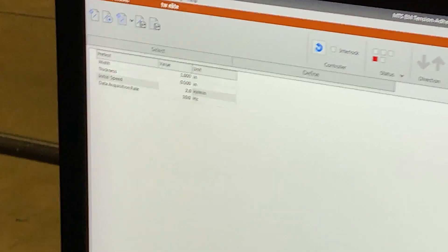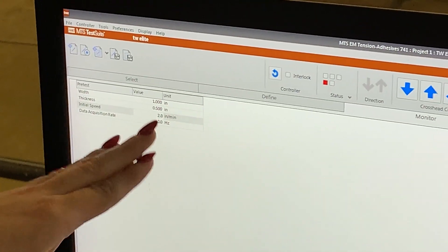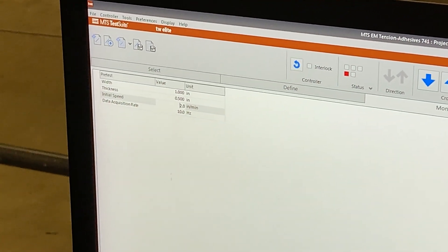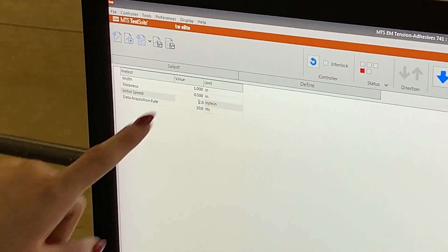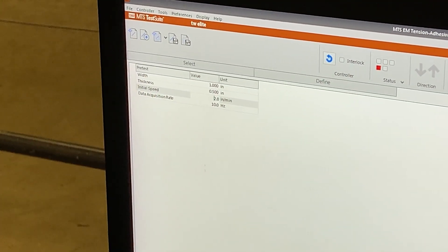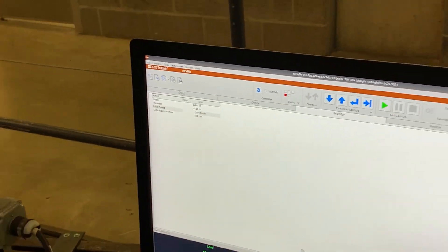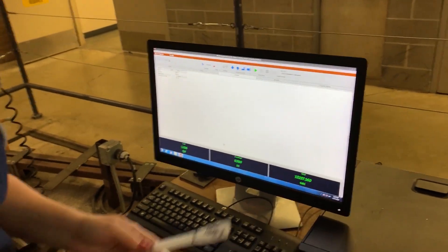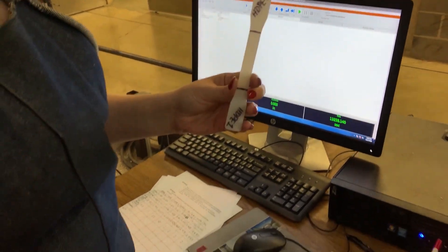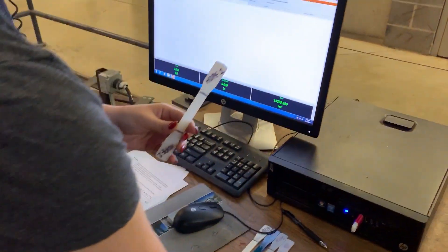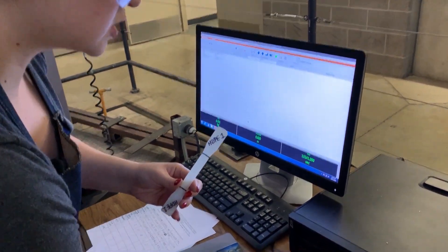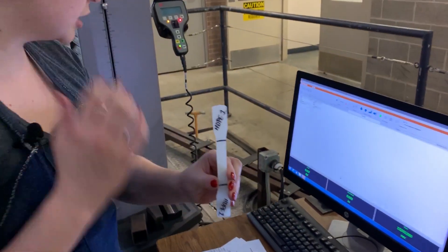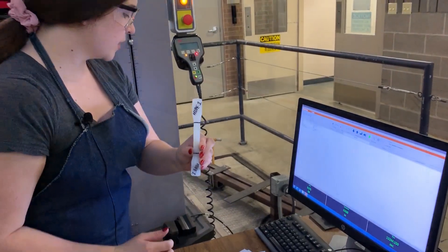We're going to be using the exact same test as we used for the adhesives lab. The only difference is we're going to be putting in all of our parameters. We're going to start off with HDPE one, and as we said, this is going to be done at 0.2 inches per minute.